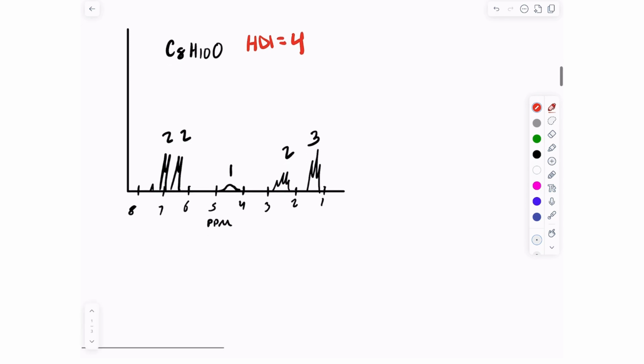Okay, next thing that we're going to do is we're going to look at our signals. So I already see some patterns here. Right here, again, there's an aromatic ring. And specifically, if you remember, it's 1,4. And also, if you want to pause this before I actually start solving it, you can do that too. But I know I'm kind of just going to the next problem. I'm not really pausing. But if you want, pause the video and try this for yourself.